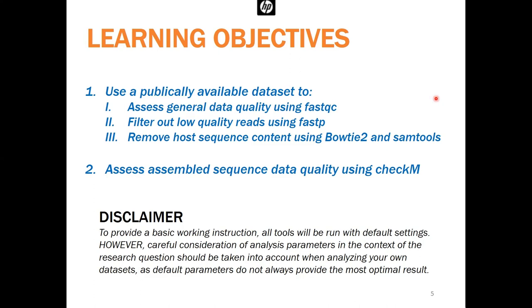Now, I have this little disclaimer here. For today's workshop, I'm going to be running all tools with default settings. Now, default settings aren't always the best, so I recommend giving careful consideration of the analysis parameters in the context of your research question. So you really have to do your due diligence when using these tools and optimizing them to fit your needs.